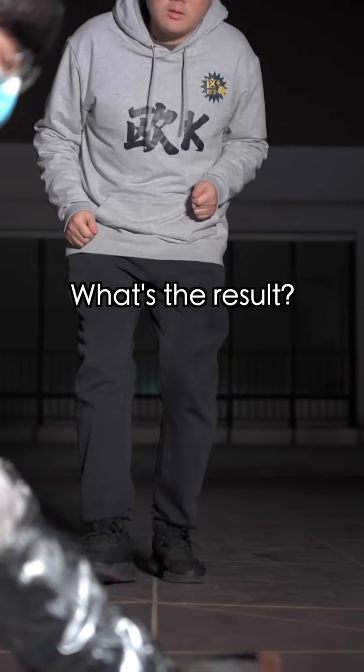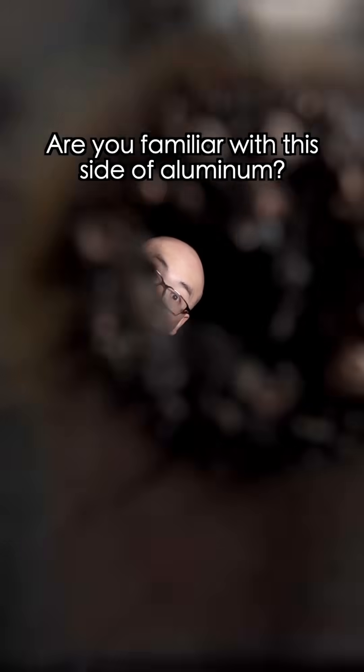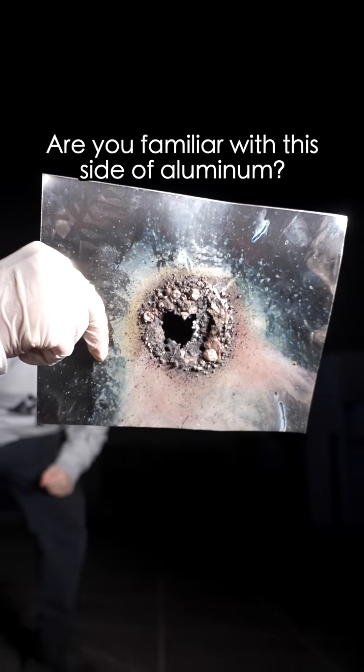What's the result? Are you familiar with this side of aluminum?